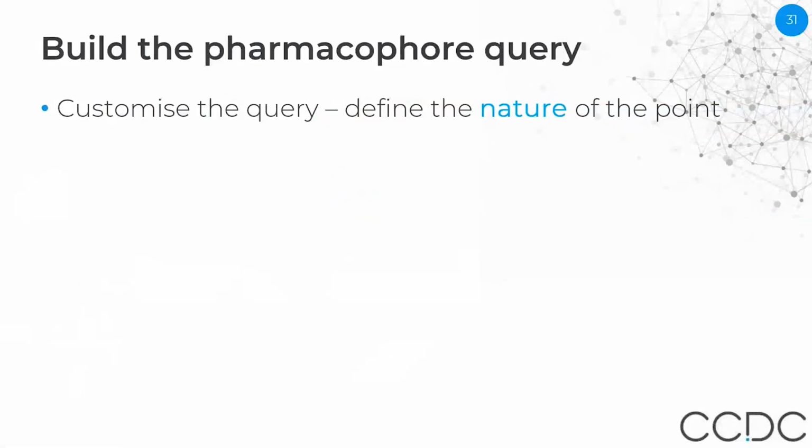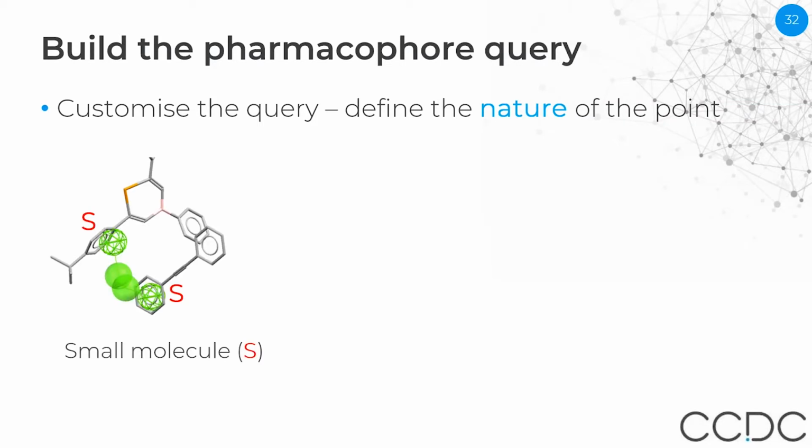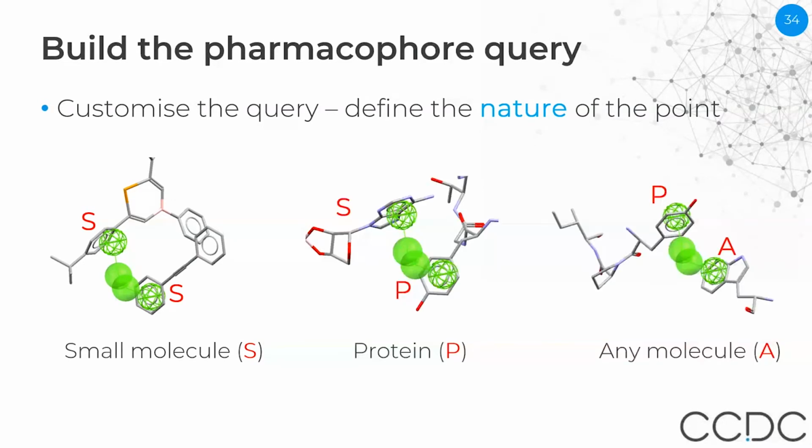So the Pharmacophore query can be further customized by defining the nature of the Pharmacophore point, where a Pharmacophore point can be set to belong to a small molecule, to a protein, or to either of the two.